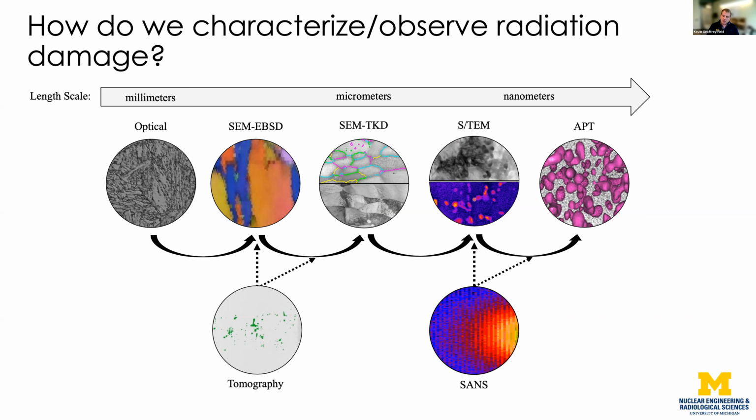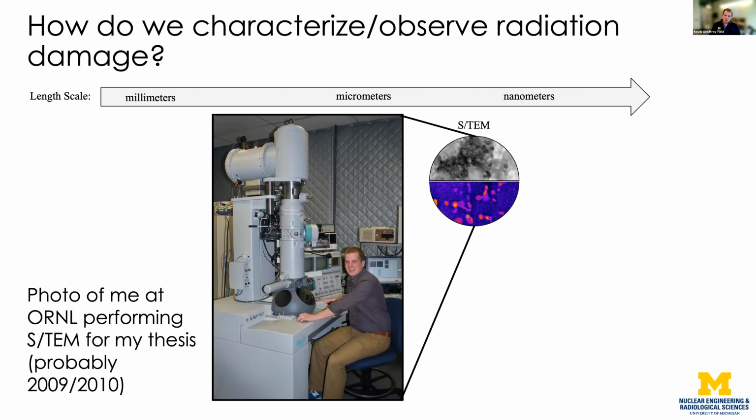I'm showing both the EDS spectra on the bottom and a diffraction contrast image on the top. We're going to stick with diffraction contrast imaging for the day, right? So we're going to be talking about these types of guys here, which is a TEM column. I figured it's primarily for a student chapter.